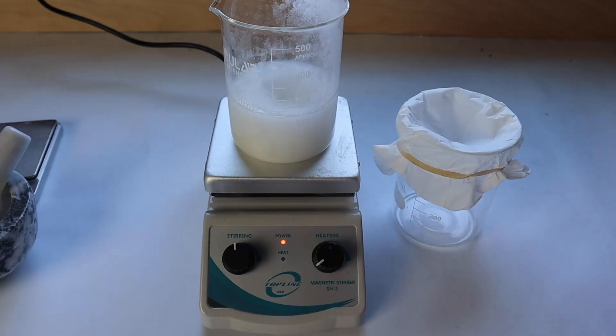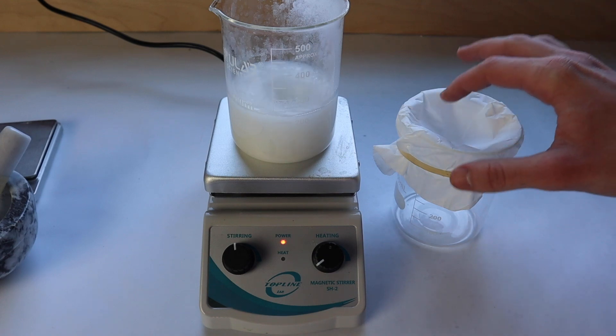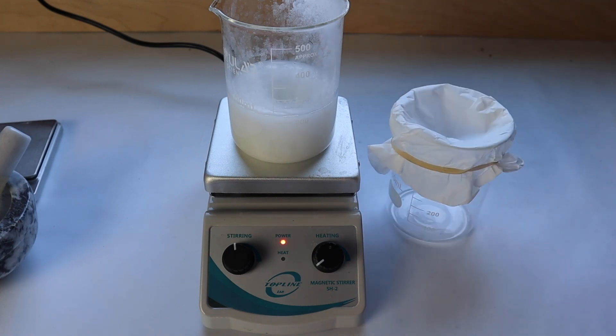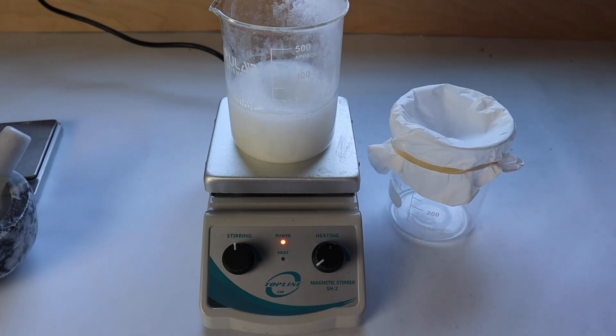Now we stir. It has been stirring for about 10 minutes. What I'm going to do now is try and filter off the stuff that didn't dissolve with this coffee filter around the beaker. If you have a vacuum filter this will be a lot easier.